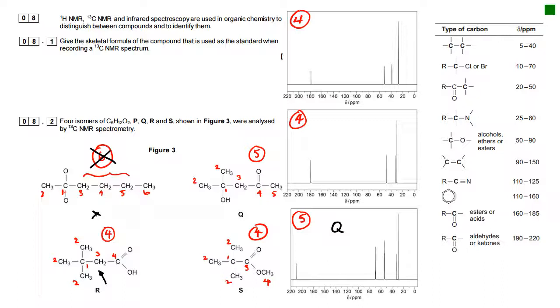But we don't find a carbon that matches the carbon that the arrow is pointed to in R. So I don't think we have that carbon in our table.